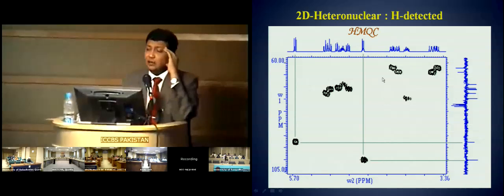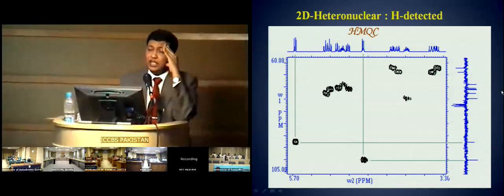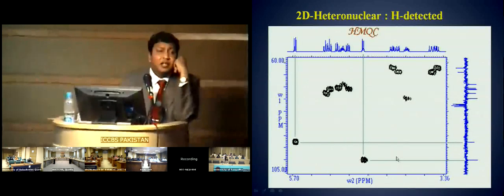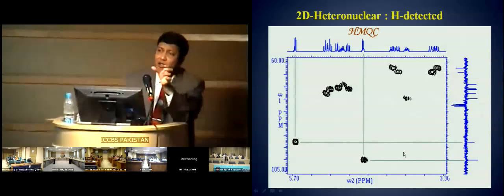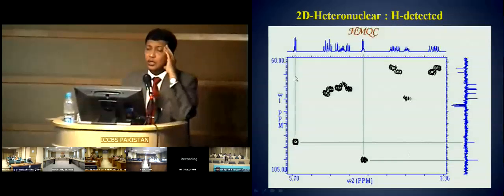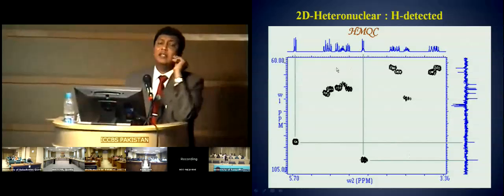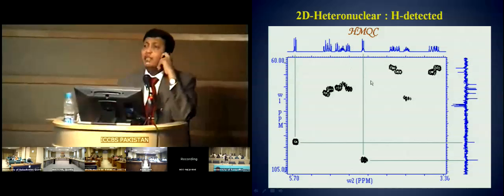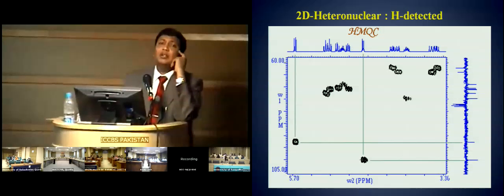Indirectly. Indirectly means that these peaks which you see are all proton peaks, but they're spread because of the coupling partners. They're spread, right? Exactly the same phenomenon as you've seen in correlated spectroscopy. In COSY, you saw that they were modulated because of the coupling partner. They are modulated also with the coupling partner, which is carbon-13, so you have a tremendous capacity of detecting carbon by detecting the carbon indirectly through its effect on proton.